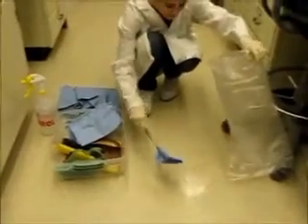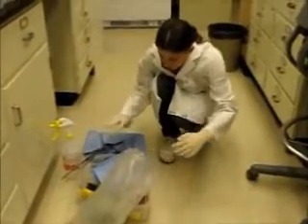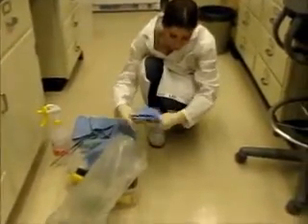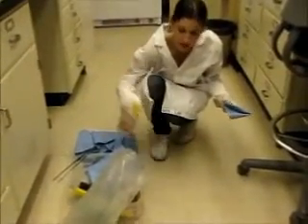And then use the tweezers to pick it up. And then use some more towels to wipe up the remaining mess after spraying it again.